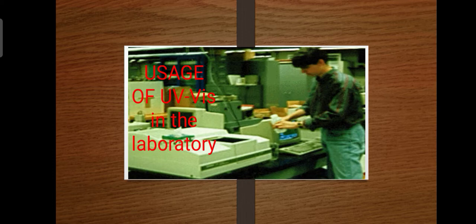So, kung lahat ng visible colors, si red, orange, yellow, green, blue, si indigo, at saka si violet are present, so yung makikita natin is white. So, if any color is missing, the eye sees that color's complement, the mixture of colors that are left. So, maaalala natin yung color wheel.